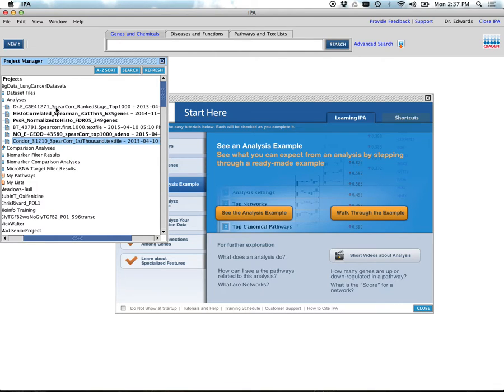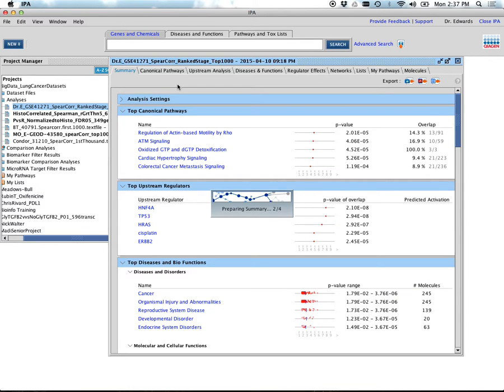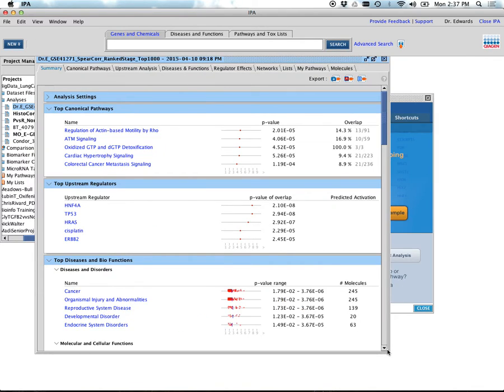So here I'm going to pull up mine just to go through what I do, and I'm going to show you how to do a comparison analysis. Be sure after today to download the gene lists that were already put out. MO, BT, and Condor all put their gene lists out. You sent them to Georgia. I did today. You should have got that today.